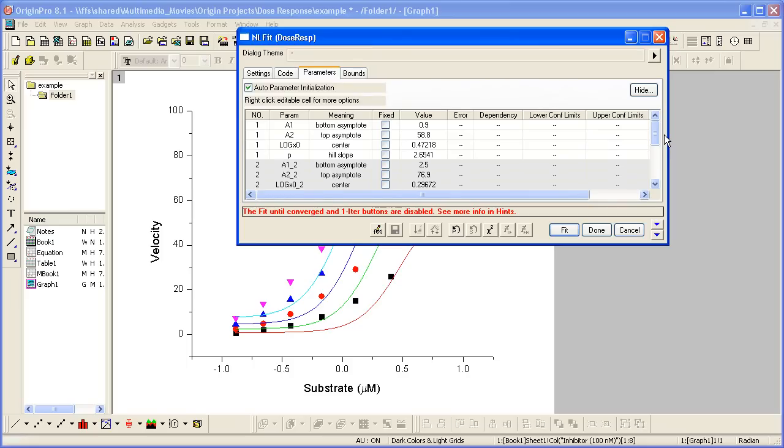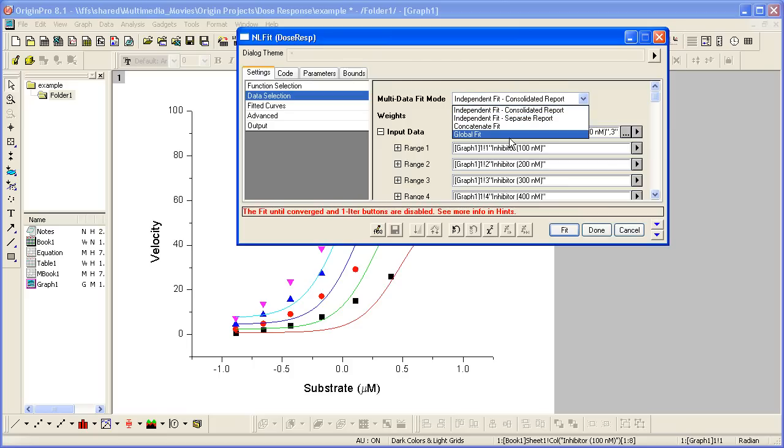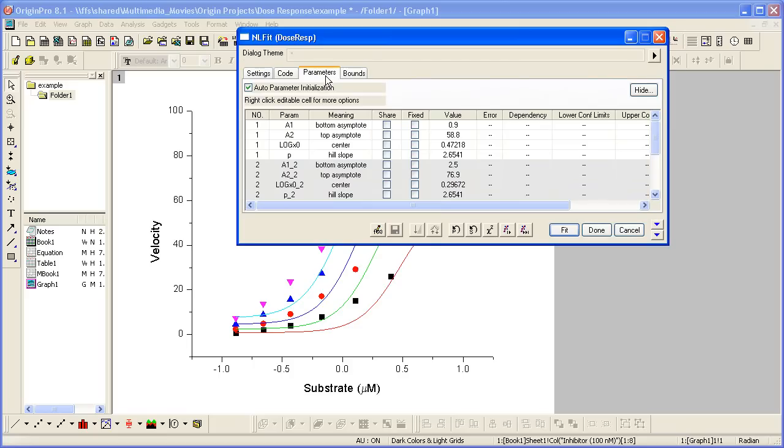So what we need to do is instead of independent fits, we need to do a global fit. And that is set on data selection, multi-data fit mode, change that to global fit. Then when I go back to parameters, I can share.